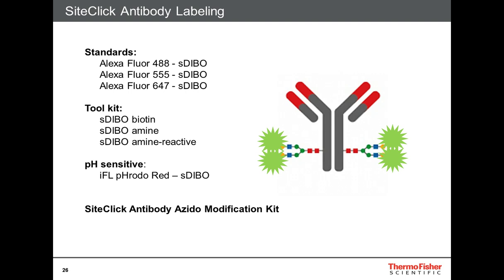There's S-dibo biotin, making it possible to attach streptavidin or streptavidin-coated magnetic beads, and the S-dibo amine and amine-reactive serving as linker reagents to conjugate whatever reactive dye you like to an azide-activated antibody.